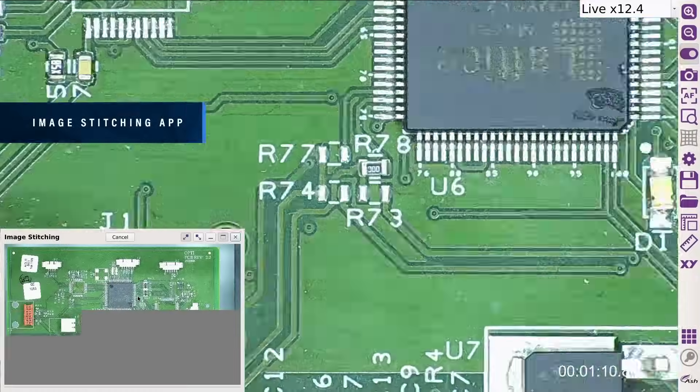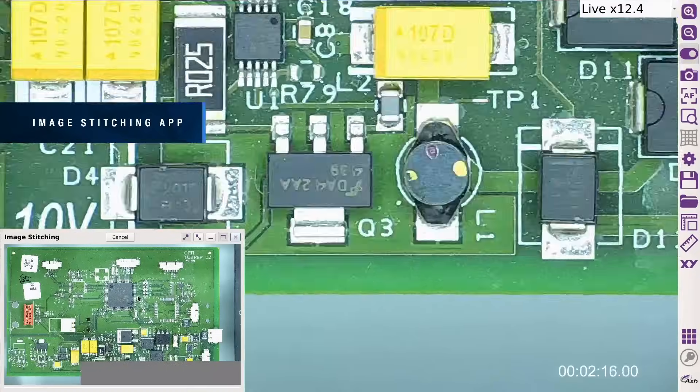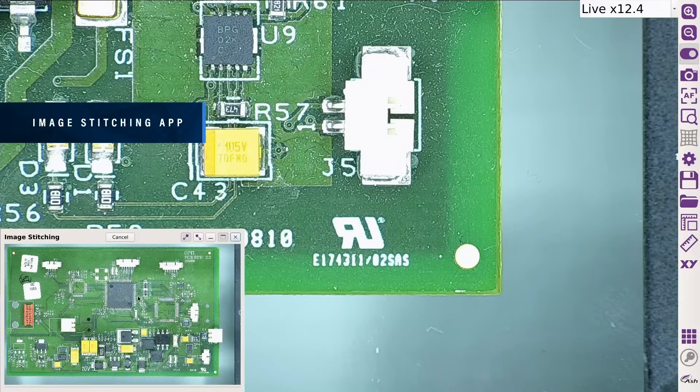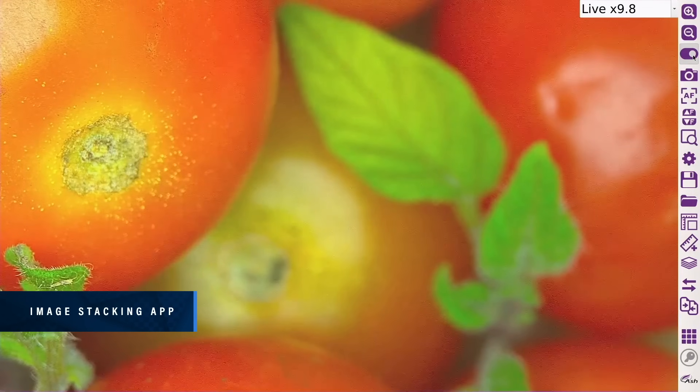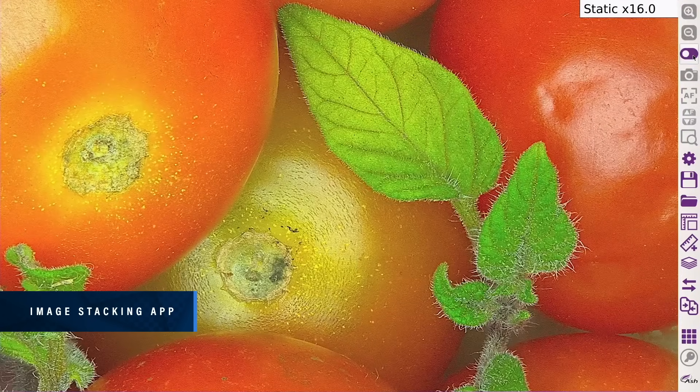Stitch multiple images together increasing your field of view at high magnification. The Enhanced Image Stacking app improves image focal depth to create one high quality, fully focused sharp image, allowing easy and fast inspection.